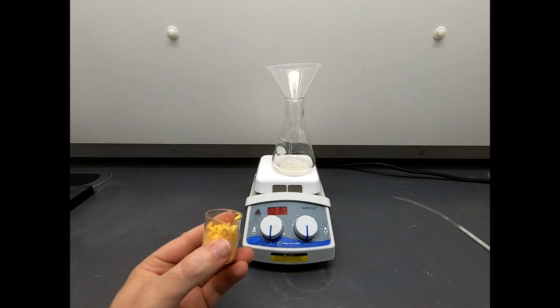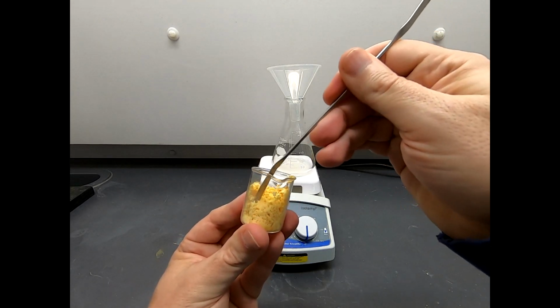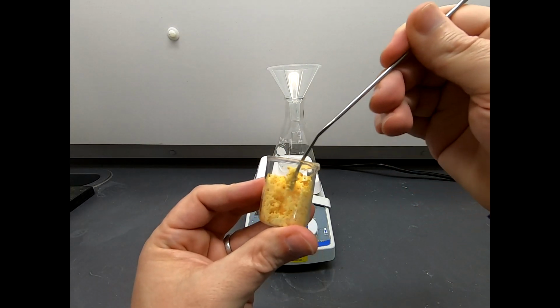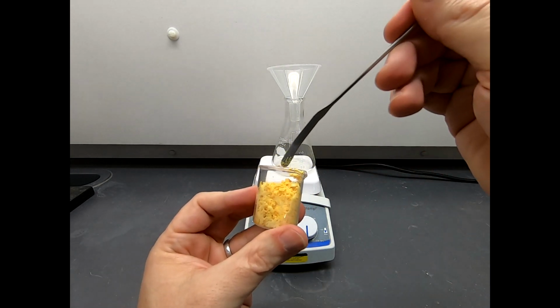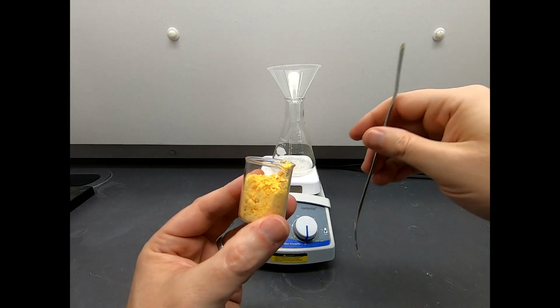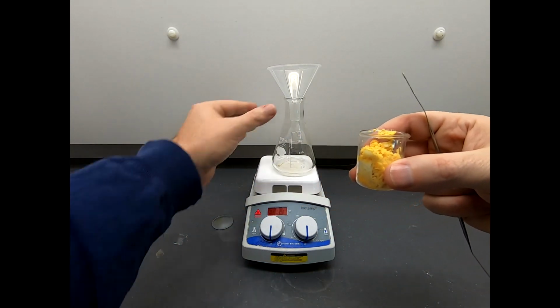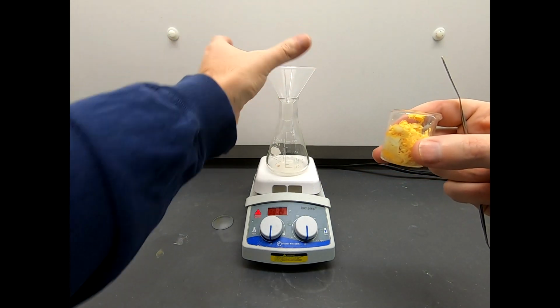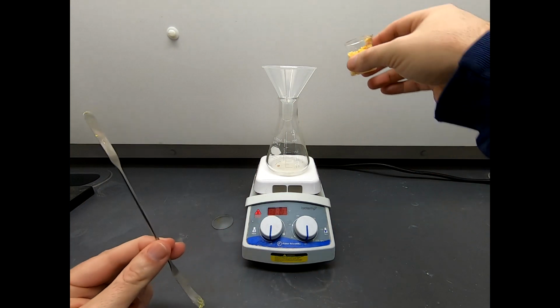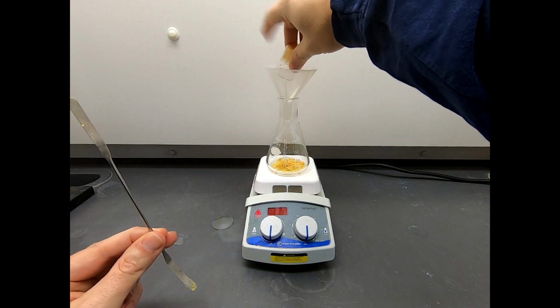Alright, now only a few minutes have transpired since I stopped the previous clip. And you can see I've broken up a fair amount of this. This is fairly loose in here. But as I break it up, this beaker is getting more and more full. So I need to put this excess solid that I've broken up somewhere. And I'm going to put it in a 250 milliliter Erlenmeyer flask, and I have a powder funnel in the top. And just to generate some volume, I'm going to dump this out.